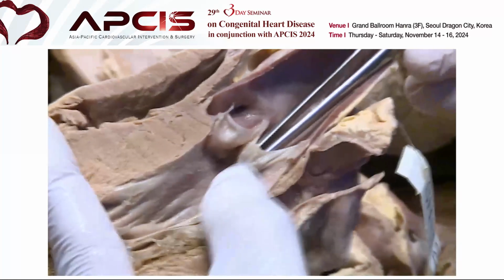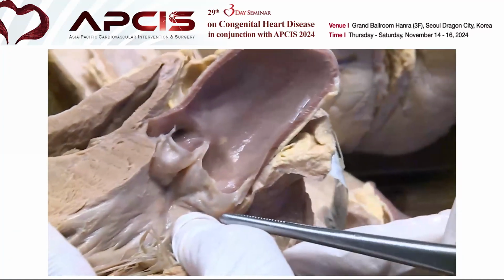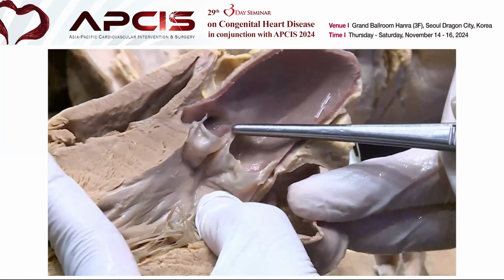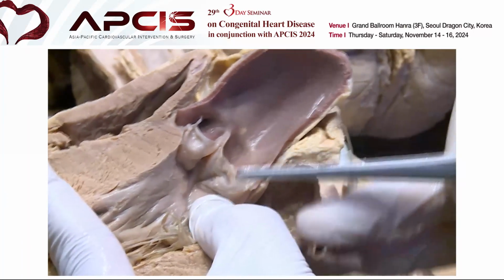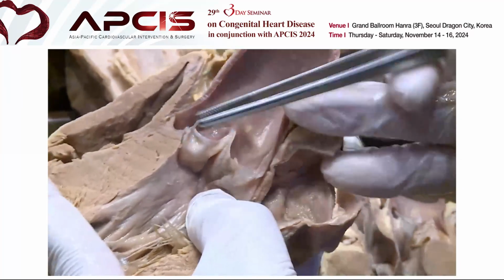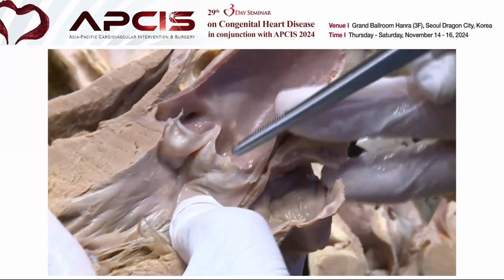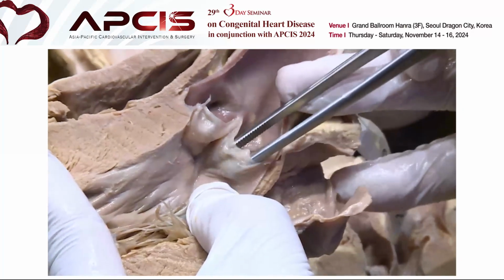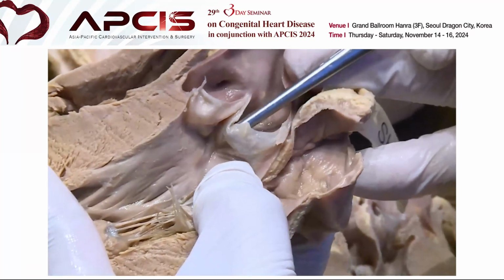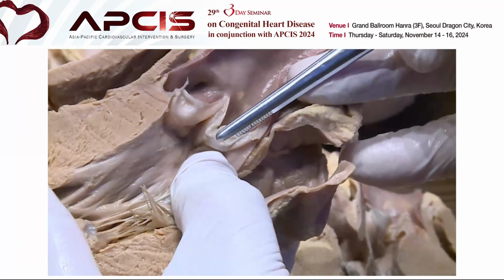And so when the surgeon removed the valve cusp for aortic stenosis, we can clearly see the leaflet with a sharp border of aortic valve and calcific nodules in the center of this area. So the annulus is rarely extended in calcification in aortic stenosis, but in advanced cases, calcific nodules are very big and produce immobility and so on.